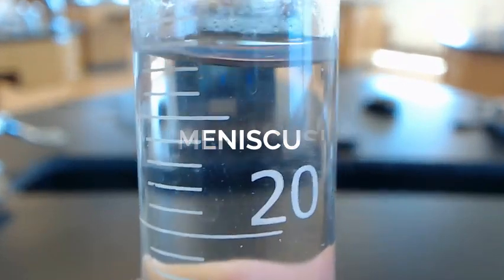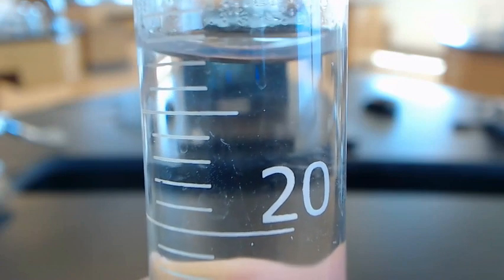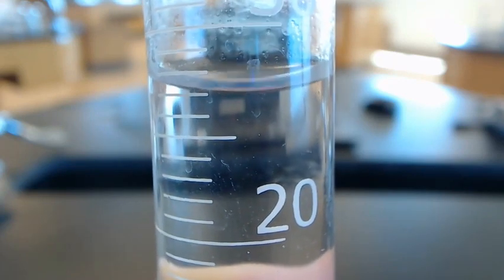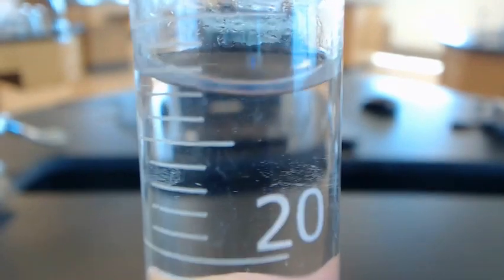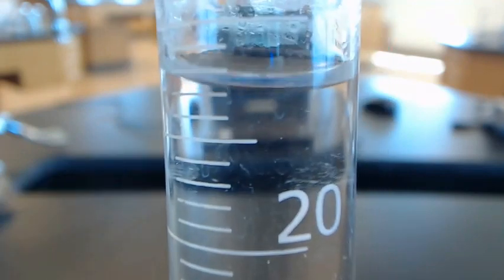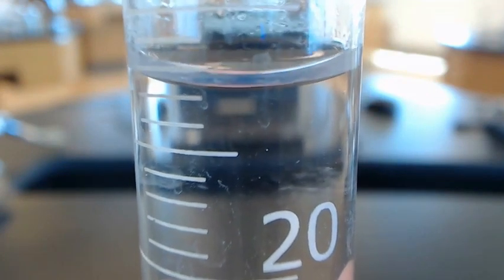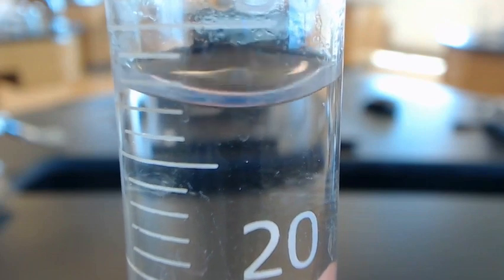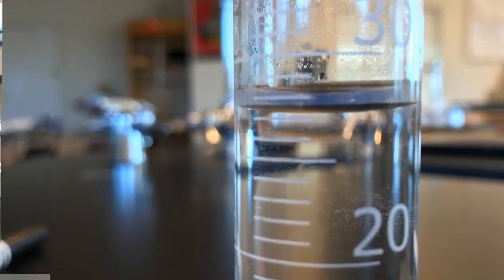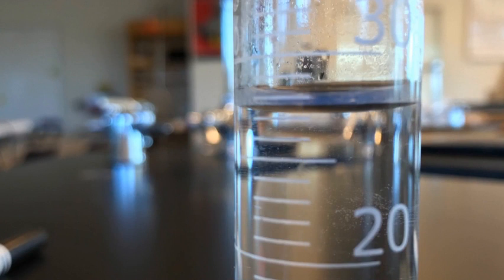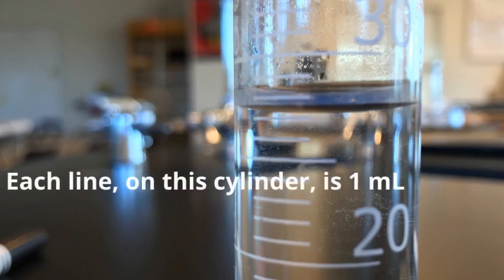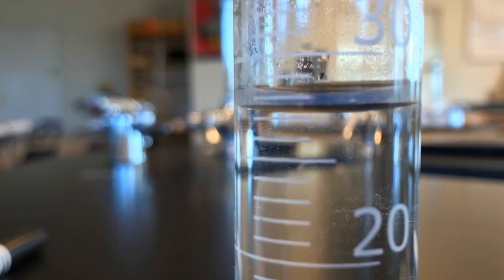All right. Sorry, I'm all shaky. The meniscus basically is formed from water creeping up or liquid creeping up the edge of the cylinder. You can't stop it. All right. The best way to measure graduated cylinder volume is to measure from the bottom, the bottom of the curved part. All right. So again, I'm going to put an image up here of this same cylinder, and we are going to measure the volume. All right. So the same thing is with the ruler. You need to figure out the increments for your cylinder. So for this cylinder, we're seeing that it goes up by ones, which is kind of nice. So we're going to look at the bottom of the meniscus, so the lowest point of that curve.